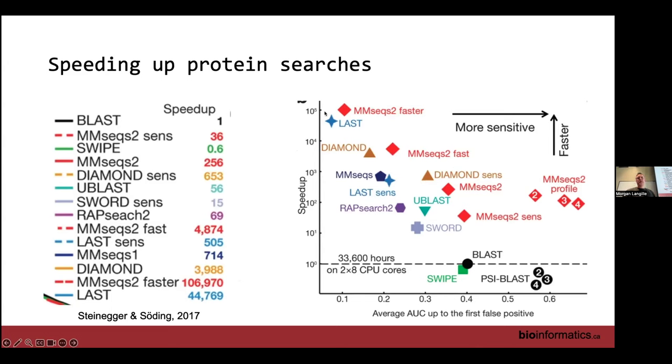They're aware, obviously, that not all the reads are going to map to the taxa they've described, either because they didn't identify the species in the first place, or because lots of these reads could characterize genes that aren't within these species. And so the second stage is to do the translated search after. They run DIAMOND on the leftover reads against the UniRef database. So it's really the basic pipeline, except that they do this first pre-screening. Essentially that helps with speeding up the process, primarily speeding up the process. And as we'll get into, they can then link taxa to functions nicely for the ones that map to their MetaPhlAn species.